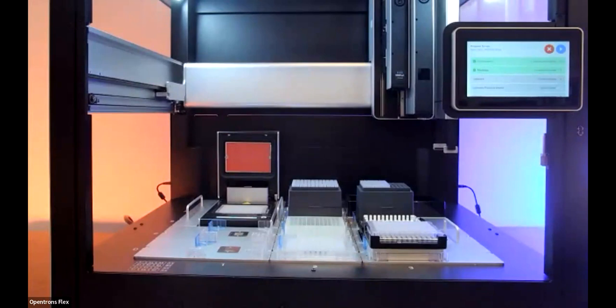Can you program loops or variables in Protocol Designer? At the moment, no, that is a Python only thing, but we are also putting a lot of work and thought into the future of Protocol Designer and looking at ways to make it easier to use. And we definitely see feedback coming on loops and variables, and so that's definitely something that we're looking into for the future.